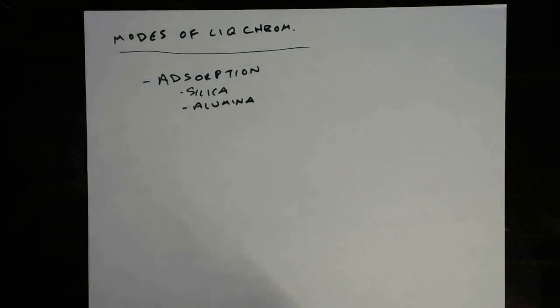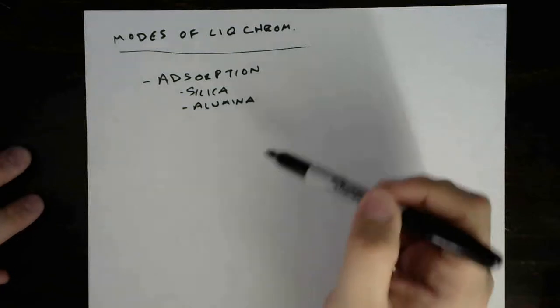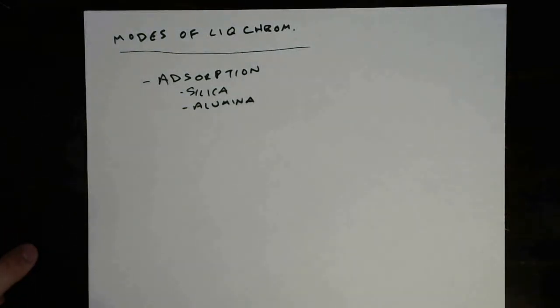We went through some math on this, and we talked about how your resolution fails to get significantly better once your peak has a retention factor greater than 15. Your peak efficiency fails to get any better. And so we lose all of the objectives of doing good chromatography at a retention factor of 15. That's the problem here: our retention factors are all going to be really huge because these surfaces hold too tightly.